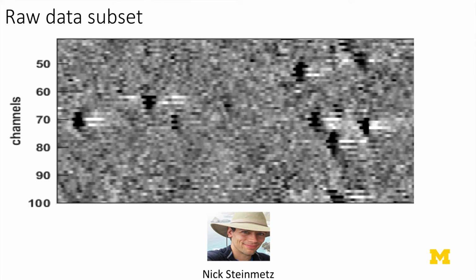And you can see these little bumps which correspond to the times of the action potential, and you can see the shapes of them as well, which presumably are back-propagating spikes, and the negativity followed by the positivity. Beautiful data. So we got this data about a few weeks before the 2014 SFN meeting, and we were really keen to present it at the meeting.